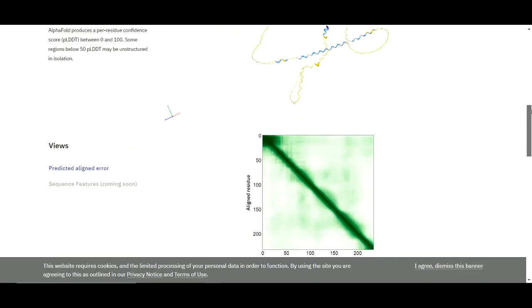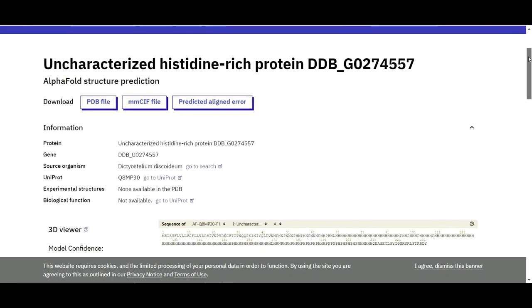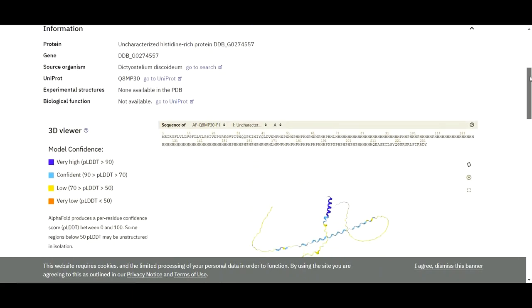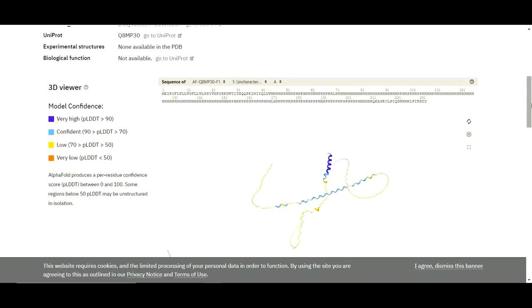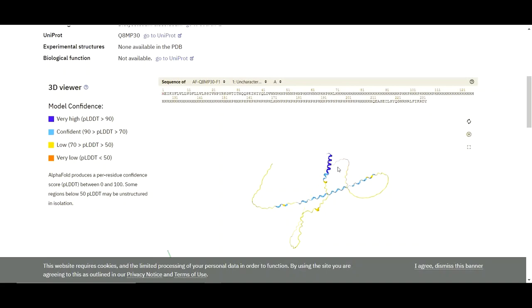Now this is your sequence three-dimensional predicted structure. Here you can see four different types of colors in that predicted three-dimensional structure of the protein: blue, light blue, yellow, and red. The blue region indicates a very high level of confidence, while the red color indicates a very low level of confidence.